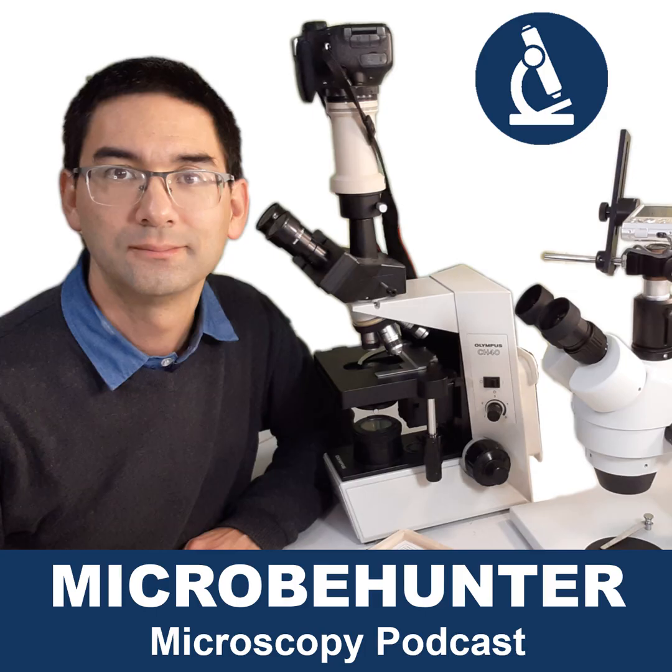I'm studying biotechnology, so I think I'm going to need a phase or a DIC, referring to phase contrast or DIC microscope. Which one do you think is the best choice for biotechnology? So first of all, thank you very much for this question. I will give you an answer to this, but you have to allow me to tell you a personal story first, which relates a little bit to that topic.